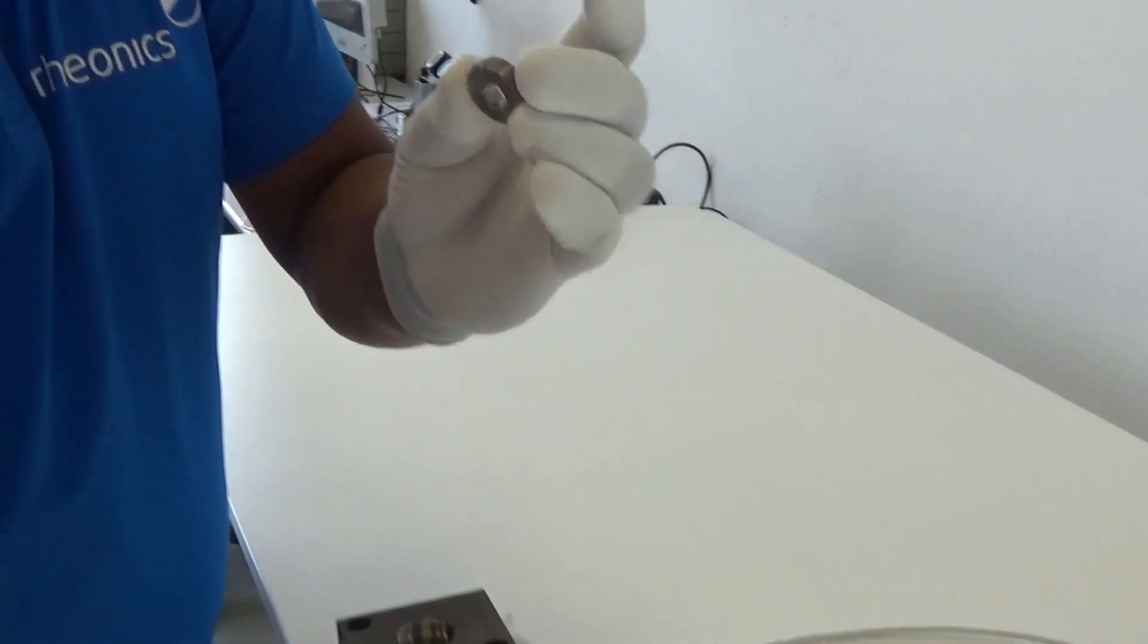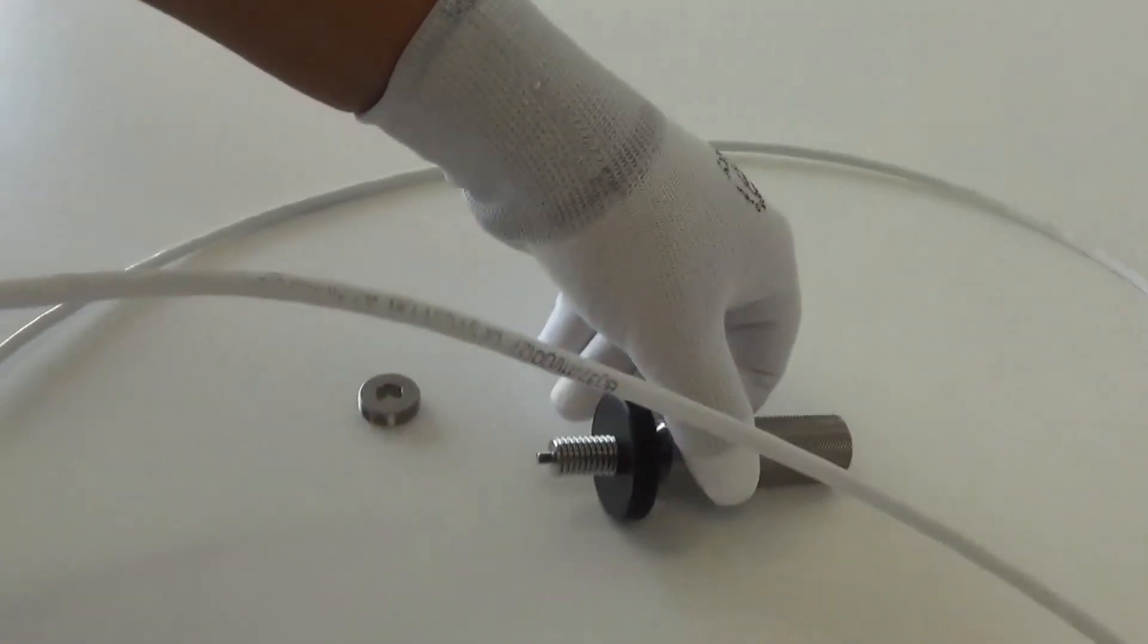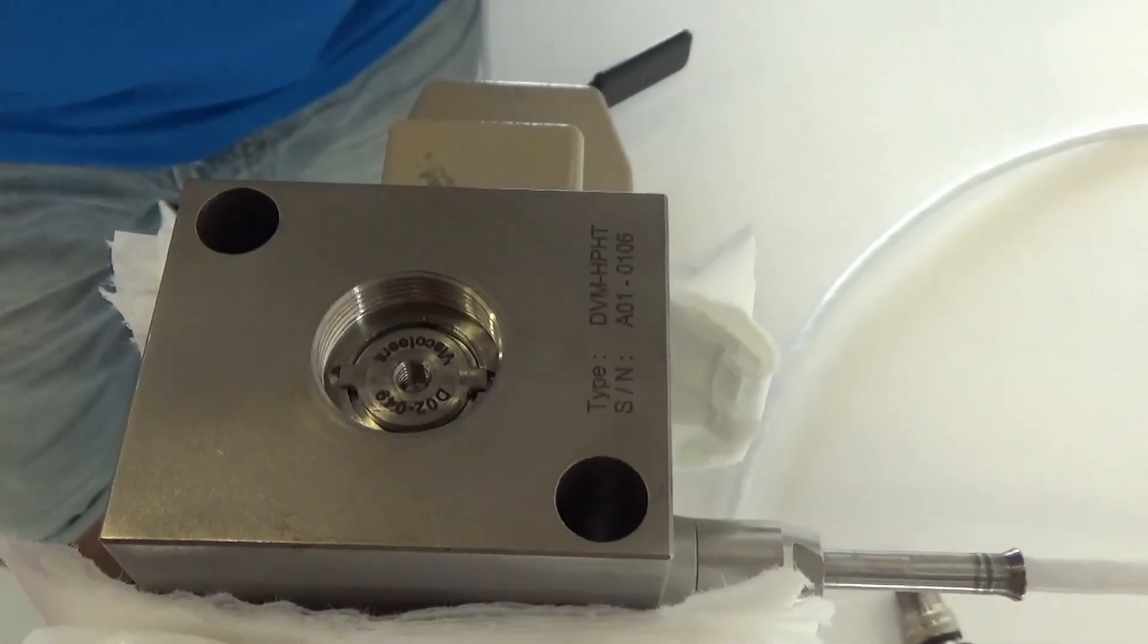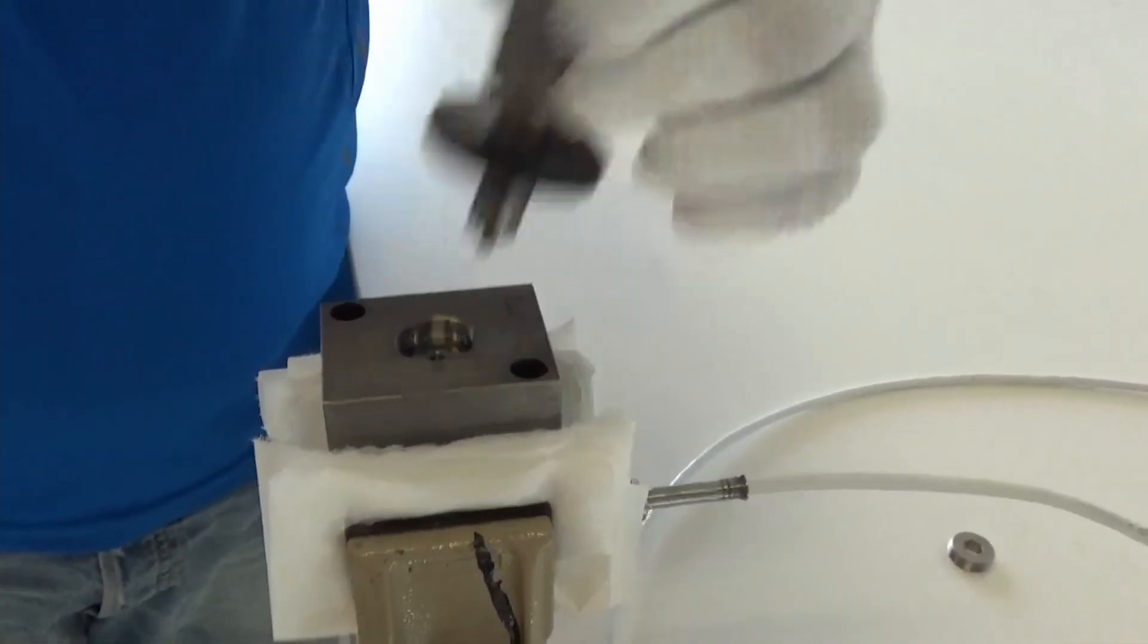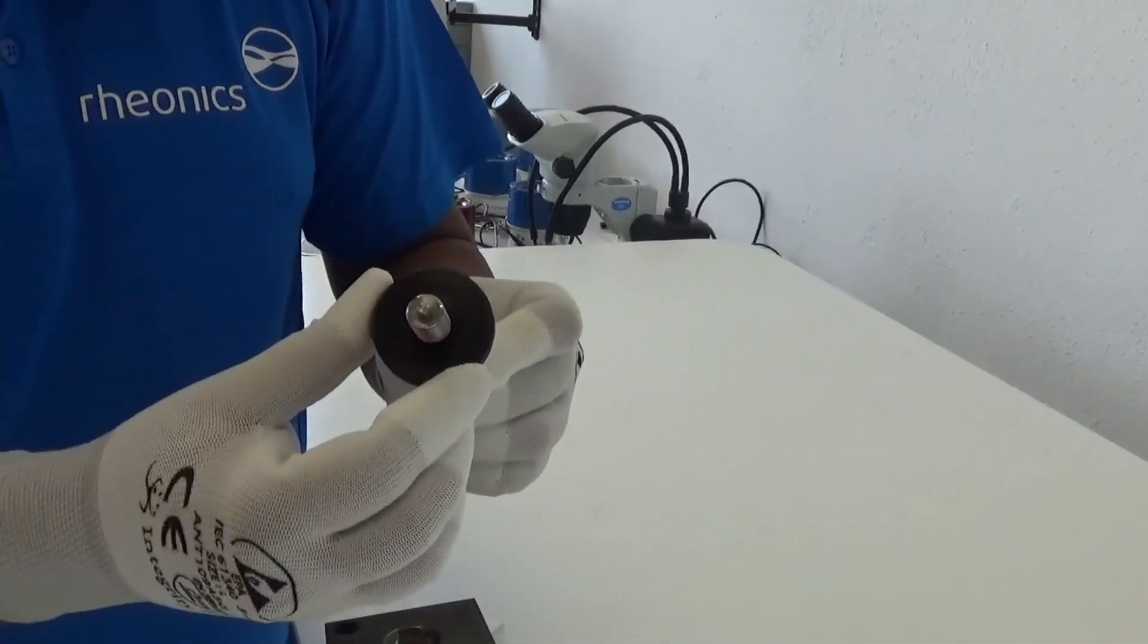Now you can see the nut here. Now take the tool for removing the sensing element. This is the sensing element you see. So you take this and you have the ring already in place. This is the ring that we will use to extract that.